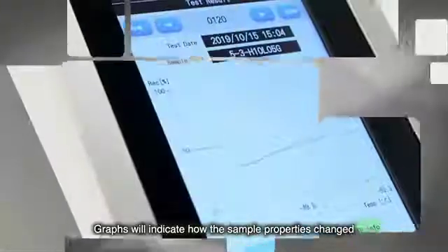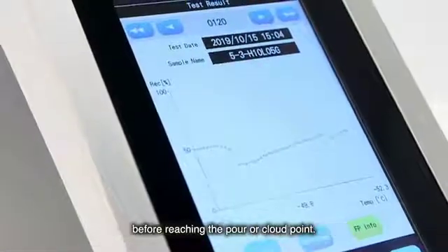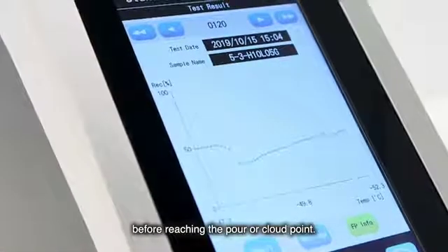Graphs will indicate how the sample properties changed before reaching the pour or cloud point.